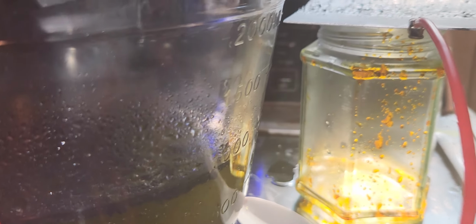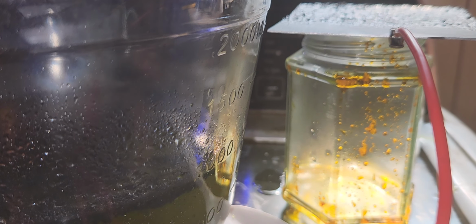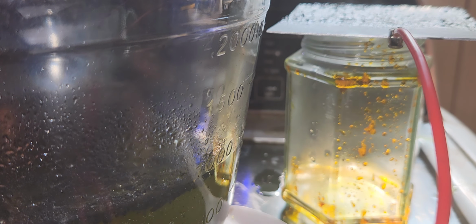If I spray it with water, it will wash off the bismuth. This is an effective but a little bit challenging way of doing it. It does look gray, but it's like a black coating, which will turn dry, a blackish coating on aluminum. It's interesting for electroplating, but it's a challenging method.